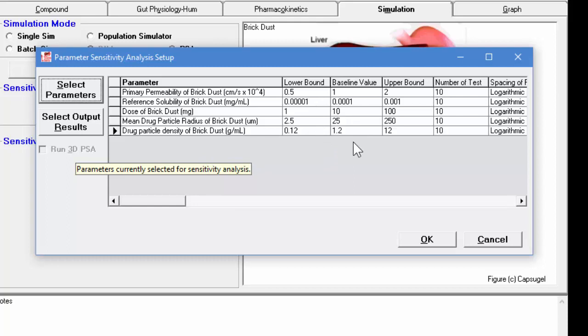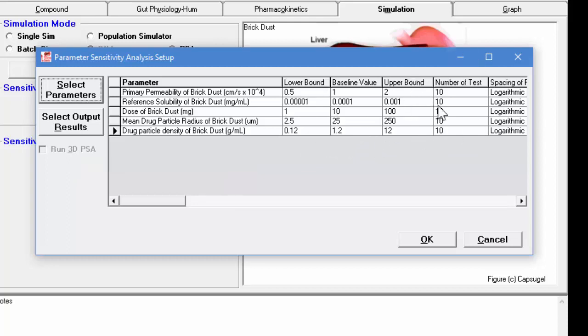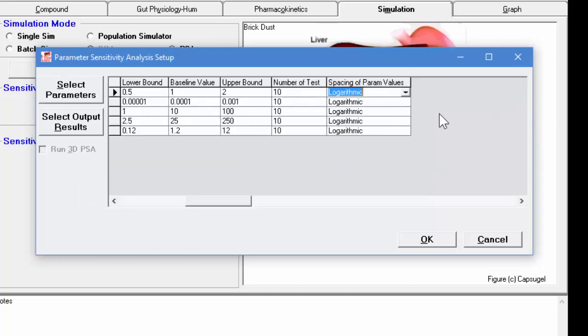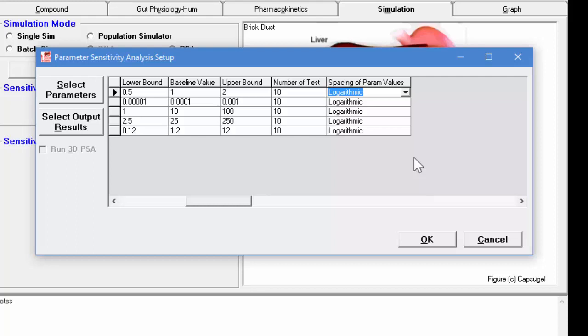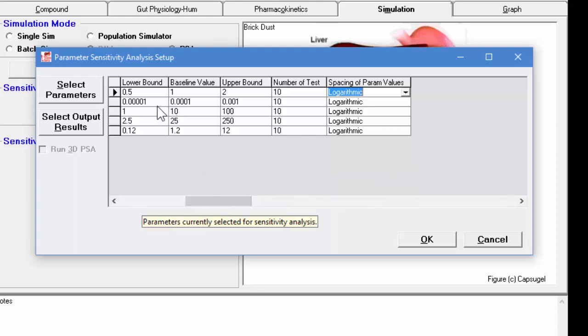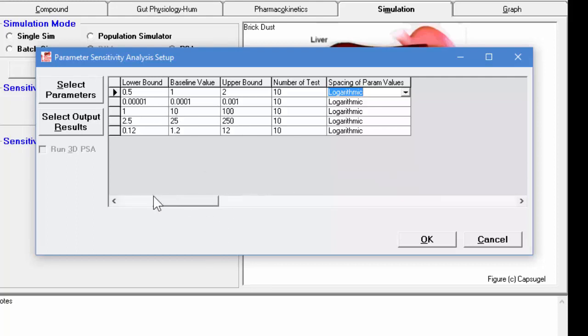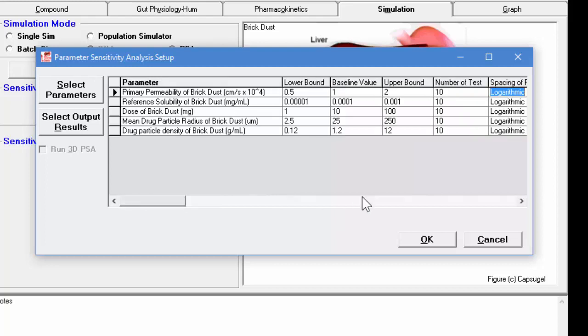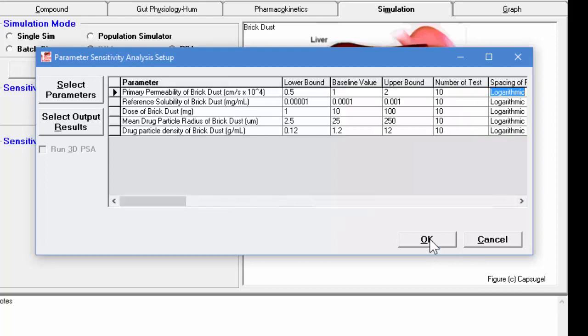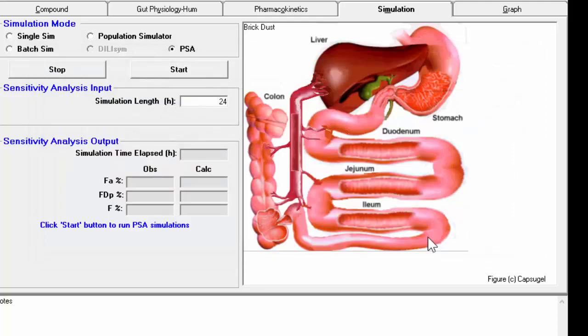So these are the values originally in the simulation. And we're going to go down to this lower bound for each one of these parameters and up to this upper bound and a number of tests. And we're going to use logarithmic. You could also change this to linear rather than logarithmic. So in order to go from the lower bound to the upper bound, it's going to do that in log increments. So we simply click OK.